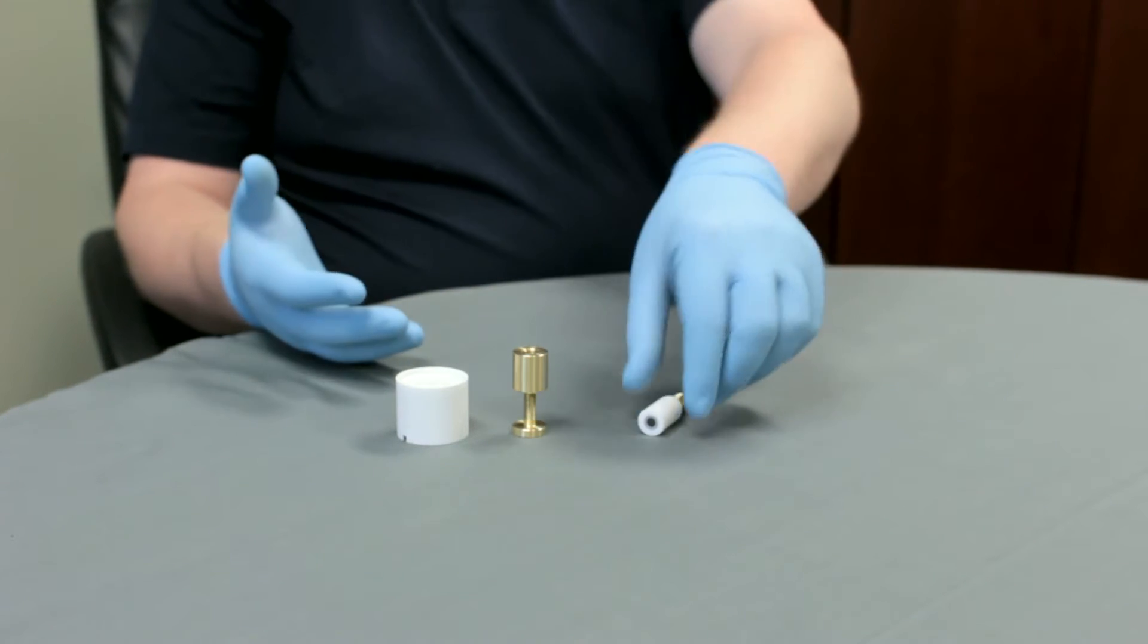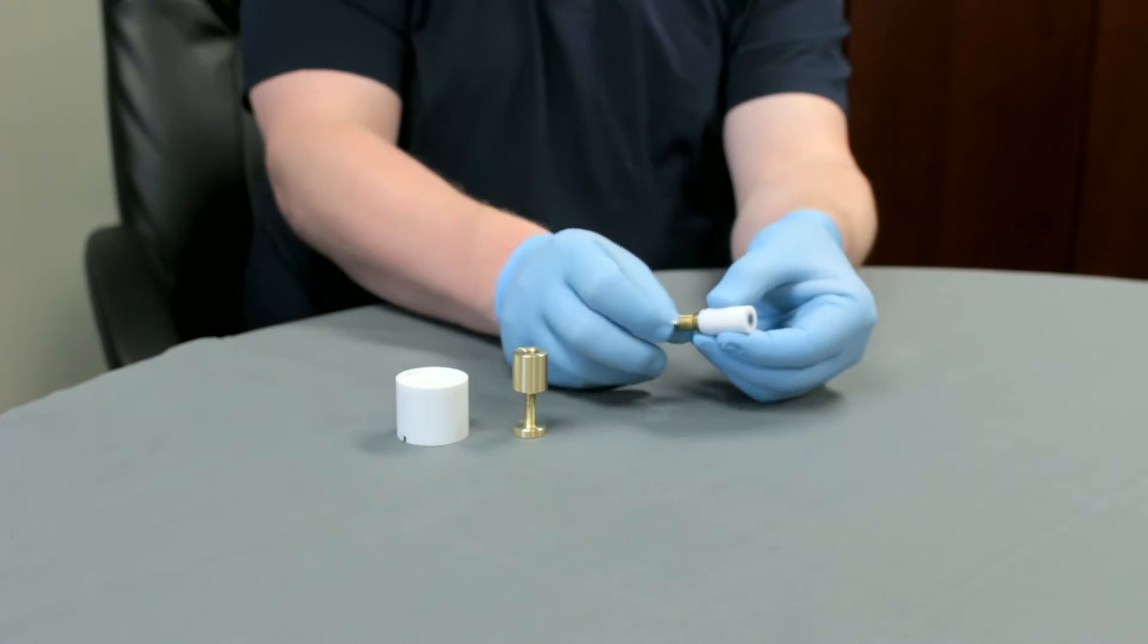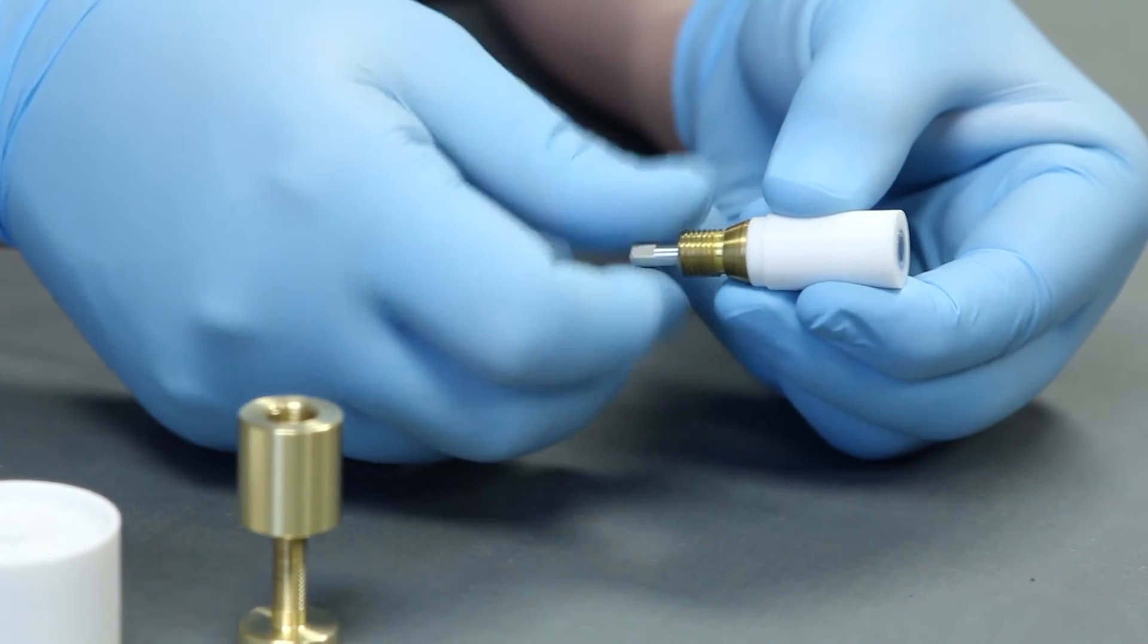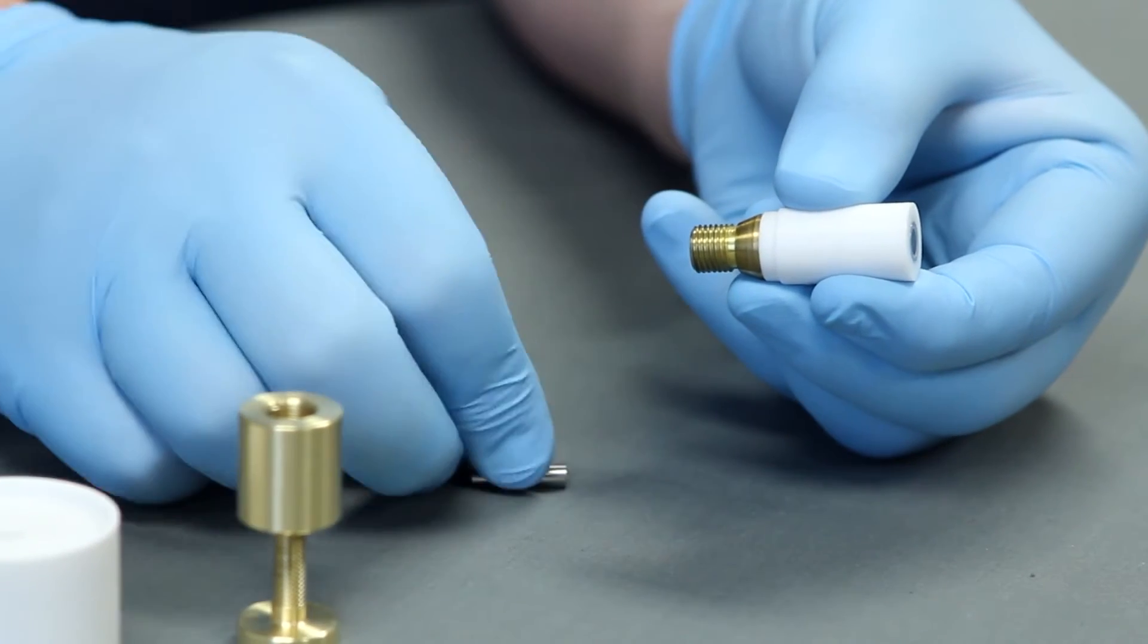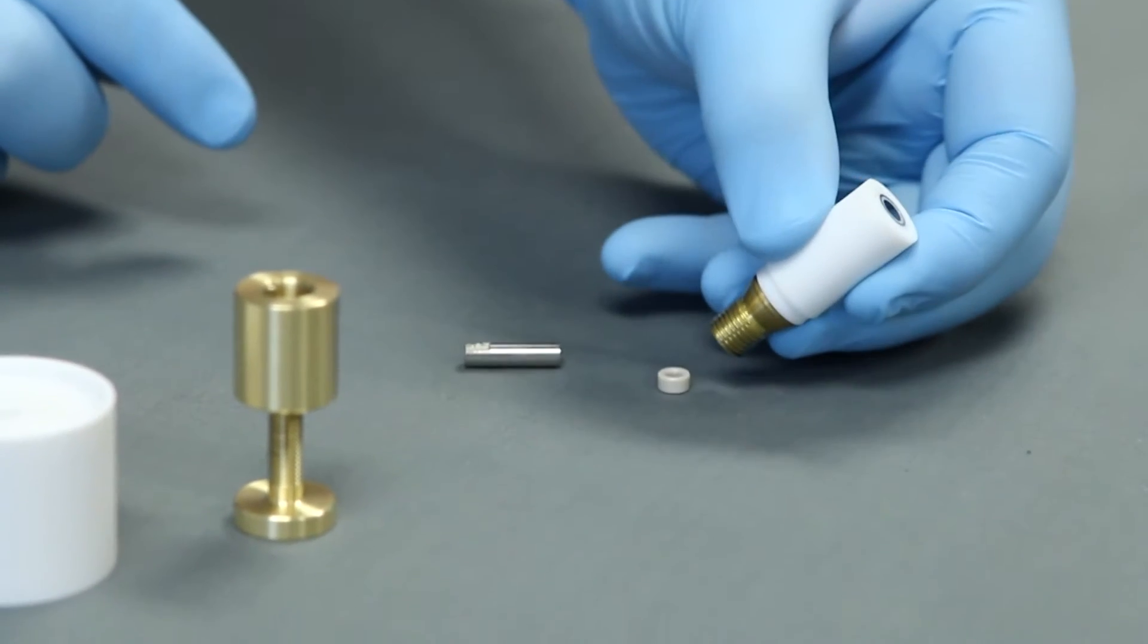To disassemble the electrode, you will want to begin by removing the disk core nut while holding the change disk electrode tip. Invert the tip so that the disk core washer will fall out.